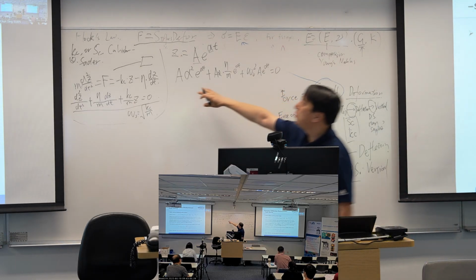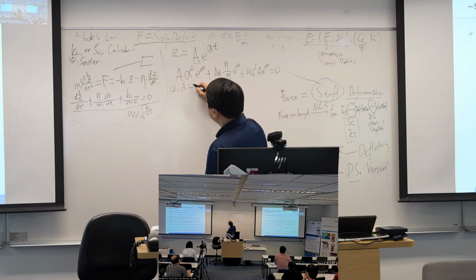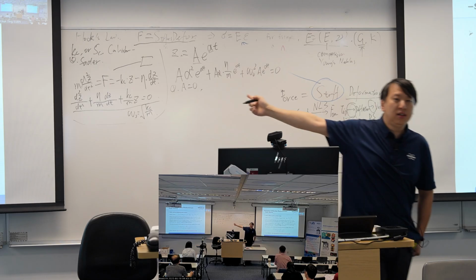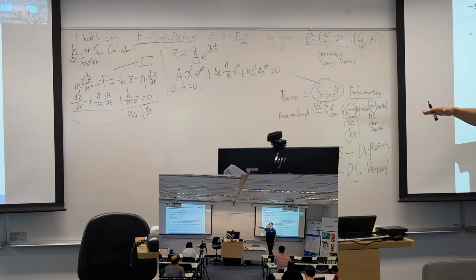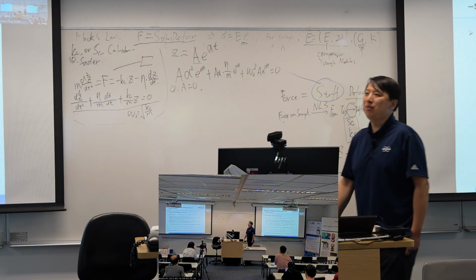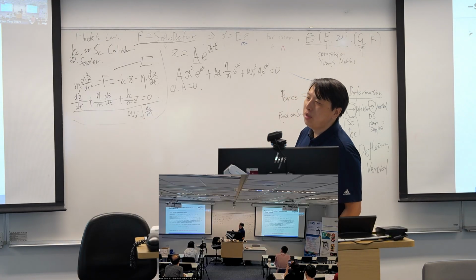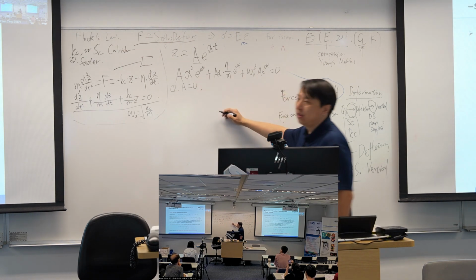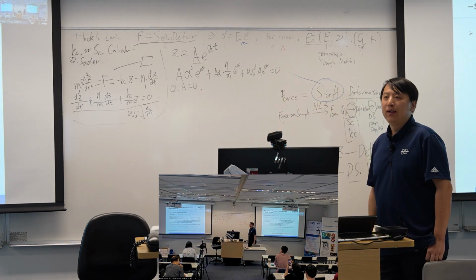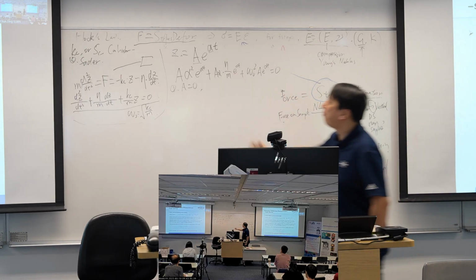Of course, from this equation, we can tell A equals 0 should be a solution. But A equals 0 means the cantilever is constantly static. Usually it's meaningless to us. It tells us no information about the case. So A equals 0, we just accept it as a solution, but that's not the solution we want.